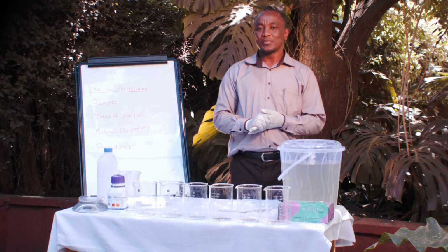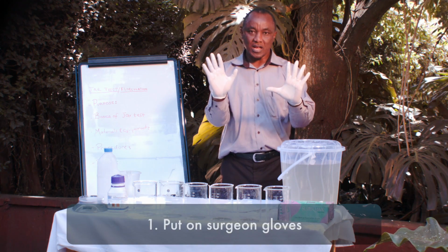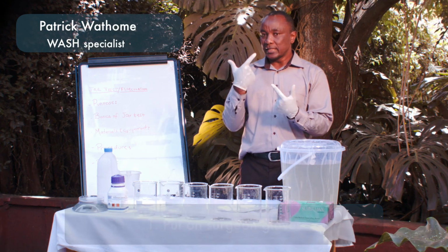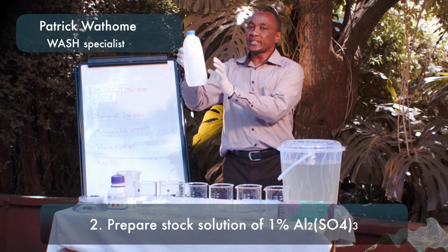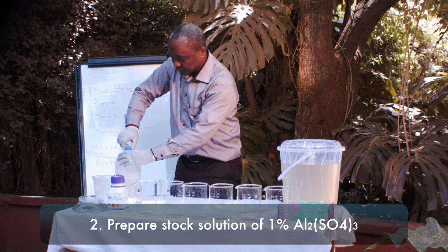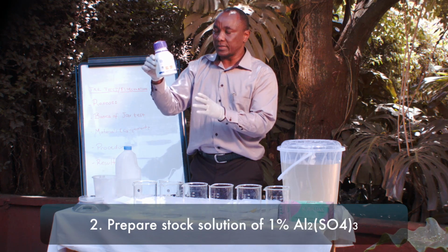The first step is to wear protective gloves. As you can see, I've already put on gloves for protection. Second step is to prepare 1 liter of clean water. Then measure 10 grams of aluminum sulfate.